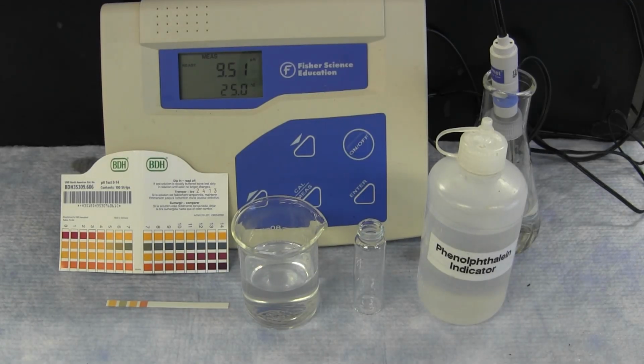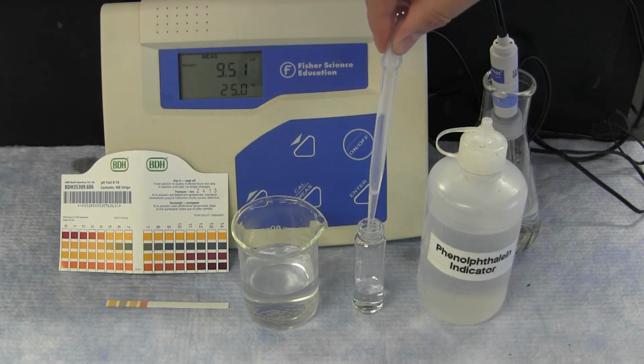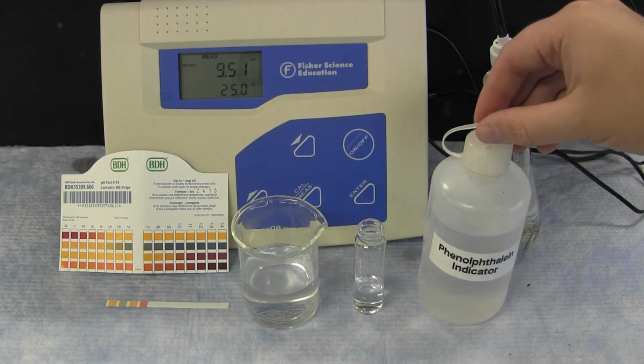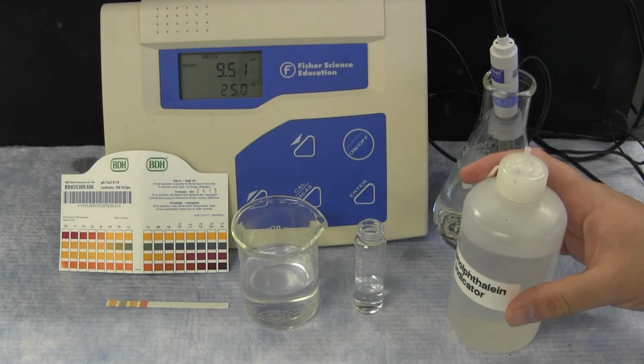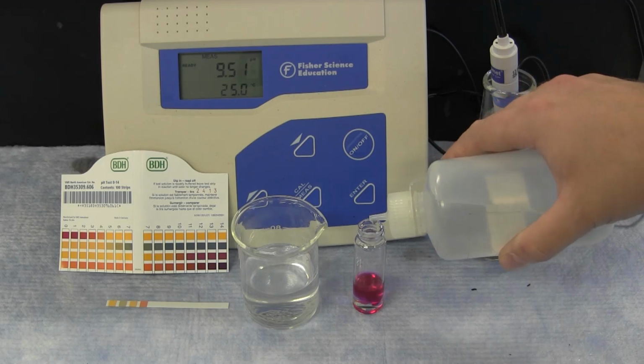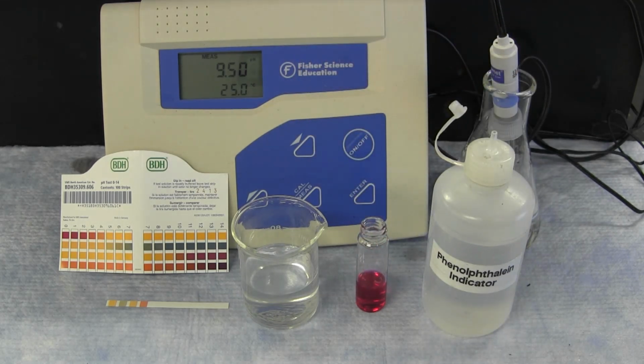The pH of a solution can be measured by 3 different methods: either pH indicator, pH paper, or by a pH meter. The solution in the beaker is a solution of sodium hydroxide. This particular pH indicator, phenolphthalein, is colorless in acidic solutions and a bright pink in basic solutions. Based on the color change, this indicator can tell that the solution in the beaker is a base. However, it does not give a specific pH number to determine concentration.